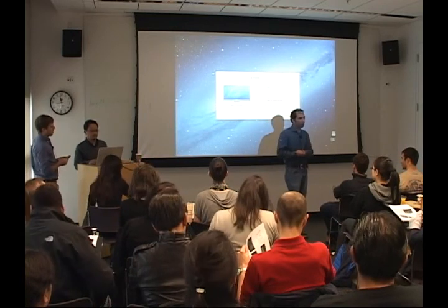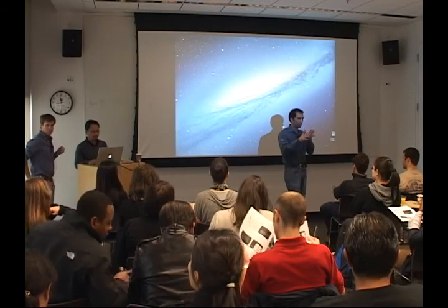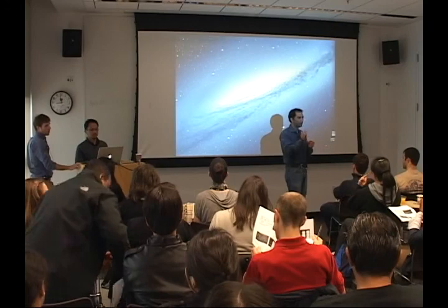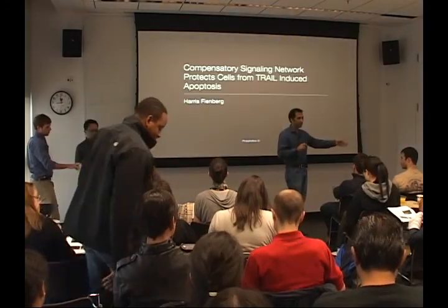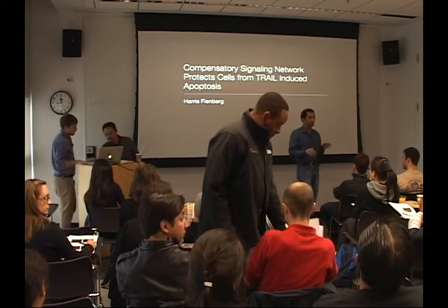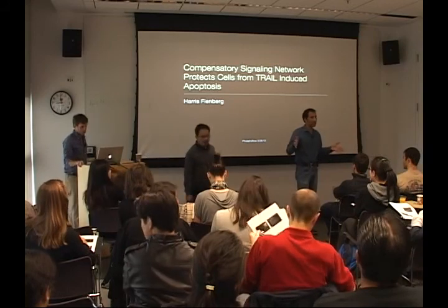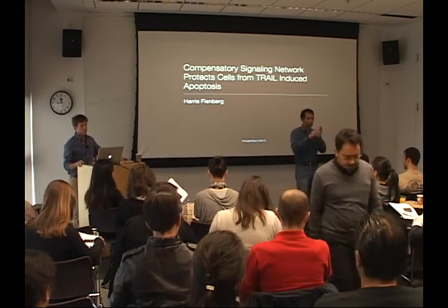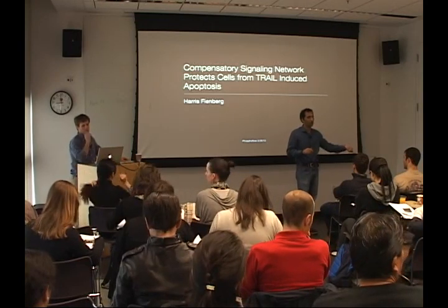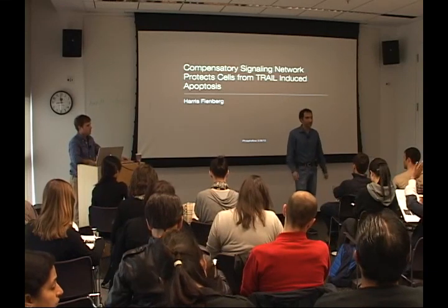Sean and Kara are doing work with B cells where they're describing patterns by CyTOF and then going back by fluorescent cell sorting and sorting out those populations, and they're getting the populations that they're seeing. So that's the best way to do those kinds of experiments: you define the immunophenotype that you're interested in, you define the biology, and then you narrow down based on being able to screen 20 markers or 30 markers. What are the 6 or 7 markers that I really need to sort this population? Then you do a separate fluorescent experiment to sort those cells out. So that's a feasible experiment. It just has to be done in 2 steps.